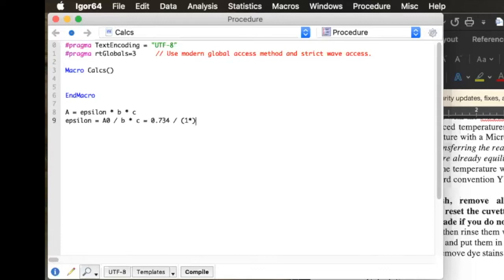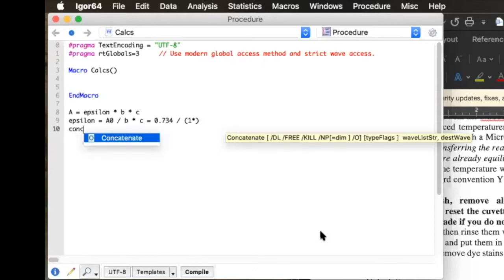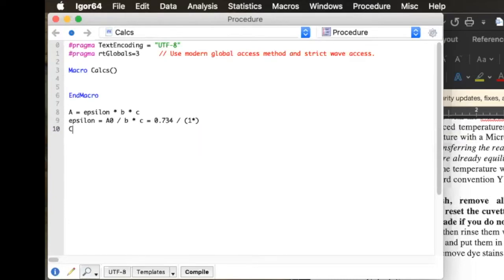We need to figure out what the concentration was, our C0. We had some concentrated solution, and we took 10 mLs of that and diluted it to 100 to make the stock. Then we took 10 mLs of that and diluted it out to 60. And this concentrated solution this time around is 4.11 times 10 to the minus 4 molar.